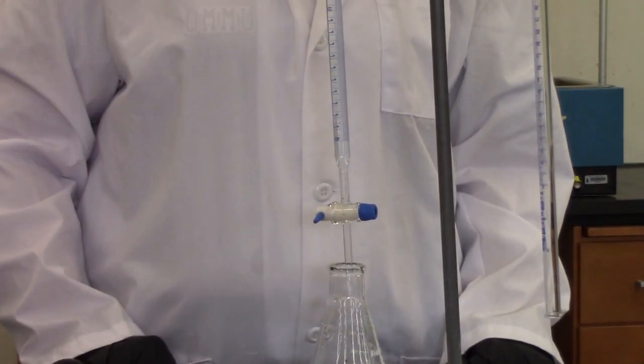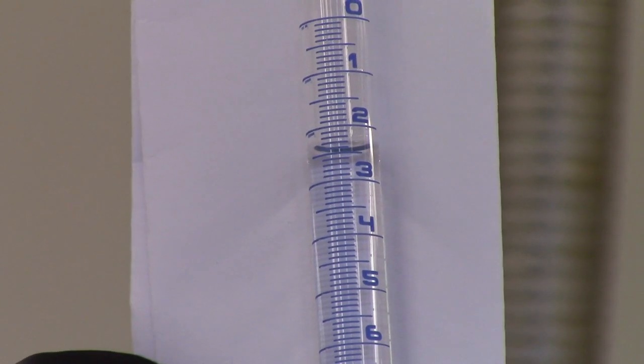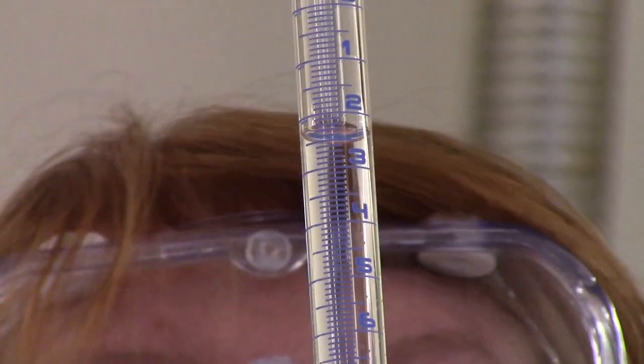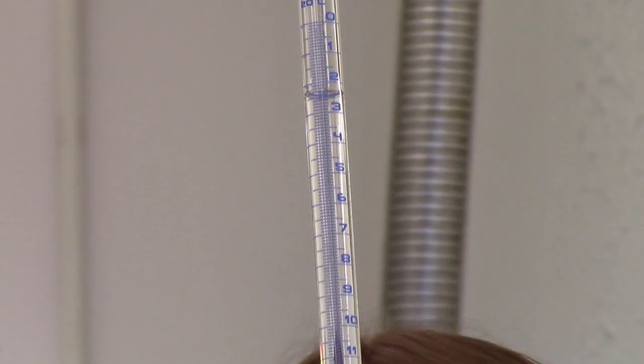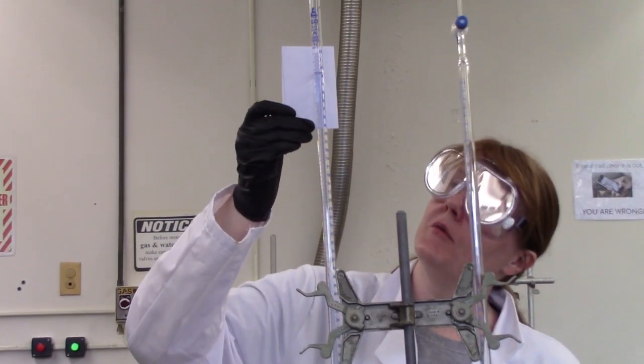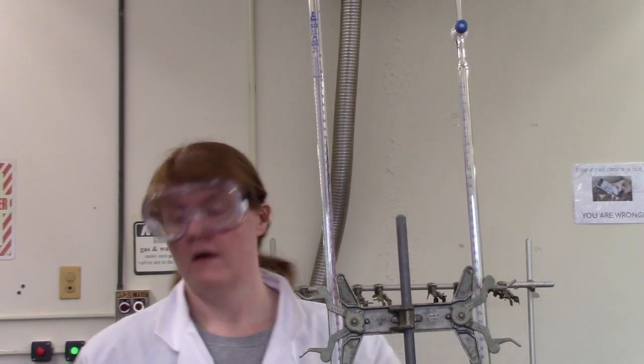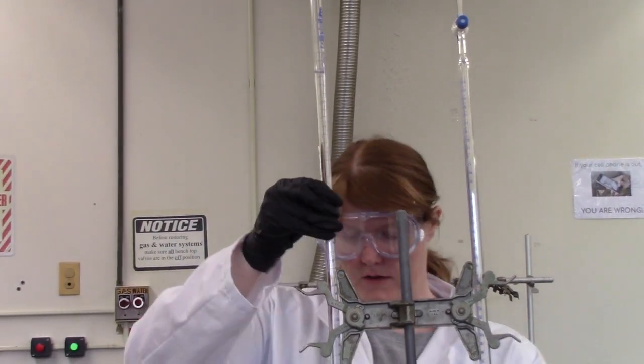In this case, I happen to fill it up right to about 2.49 milliliters. So if you want to take a look here, I think this is 2.49. Now, if you thought it was 2.50, that's possible. The camera is currently at a lower angle, and you'll notice every time I read my volumes, I'm trying to get up eye level with it. We do have stools in the lab. It's a lot easier than tiptoes, also more accurate. Okay, but remember, you got to be eye level. If I'm looking at it from below, my volumes are going to be higher than I think they are, okay?